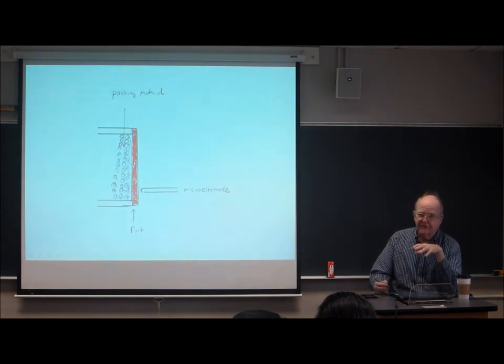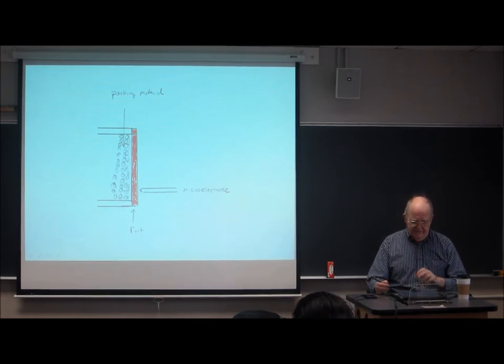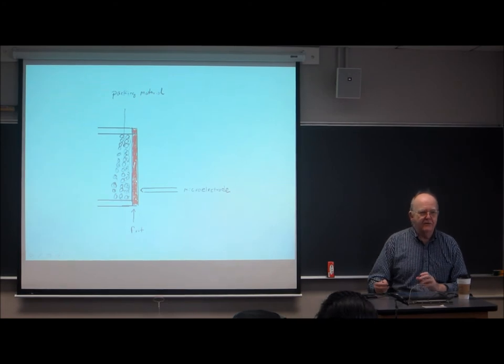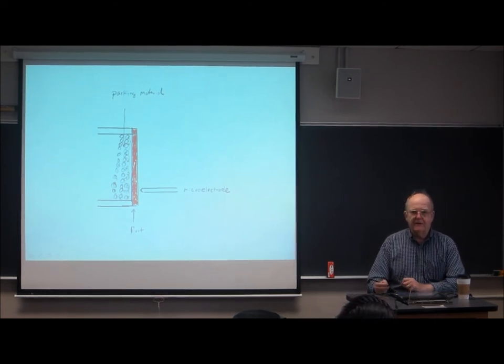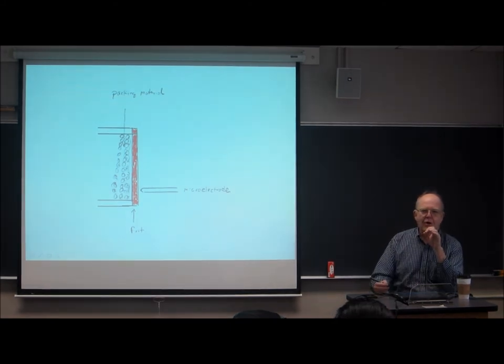Now I want to show you some experimental data that proves that this problem exists. And this is a really neat experiment that a fellow, Mark Wightman at Chapel Hill, did about 20 years ago. Wightman is not a chromatographer. He's an electrochemist. And his main claim to fame is that he makes ultra-micro electrodes. It has a diameter of 1 micron.